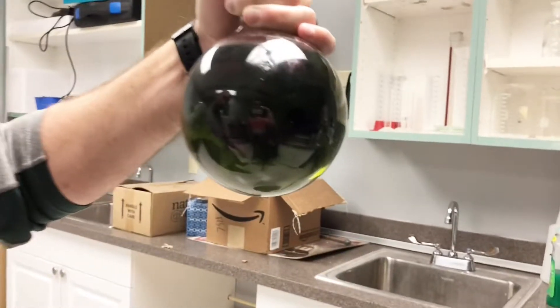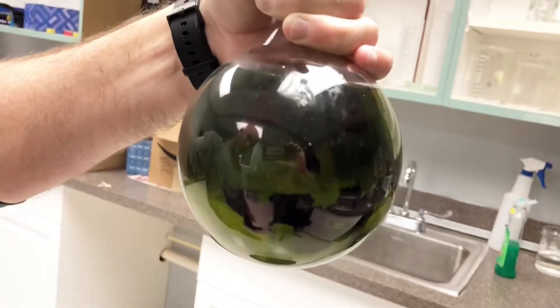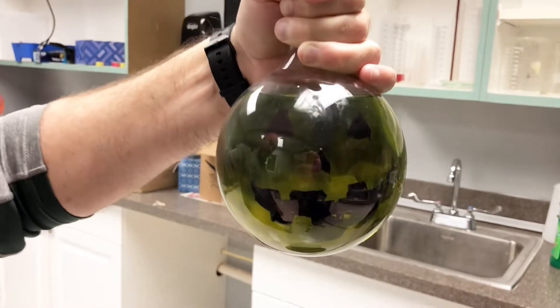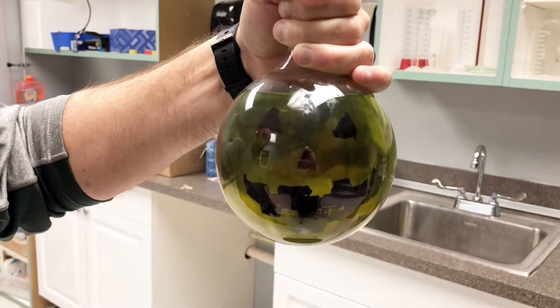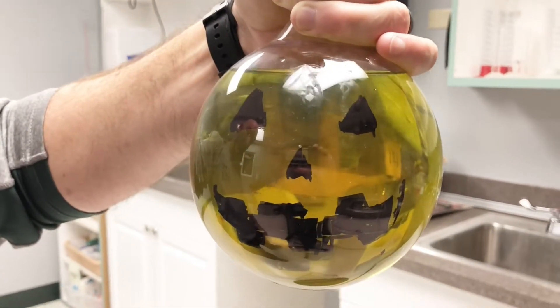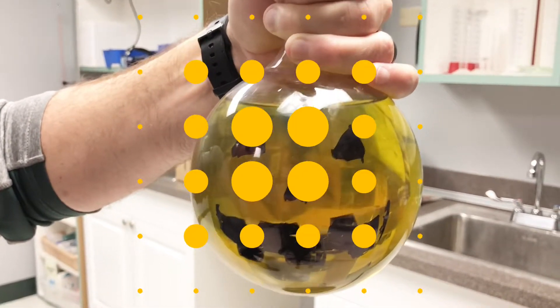Let's turn it on green — see how it's changing? There it comes back. At least semi-orange. All right, cool.